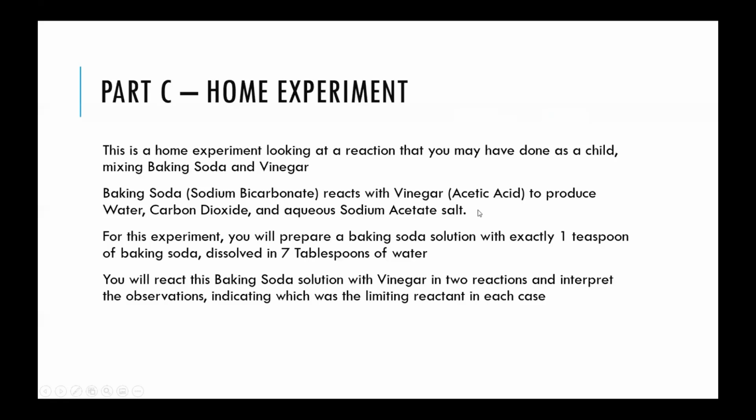The overall reaction for this produces water, carbon dioxide, and sodium acetate, which will be aqueous and dissolved in its ions. Now, this reaction does not produce a precipitate. This reaction produces carbon dioxide gas. So you should be able to visually see the reaction going on as it bubbles.